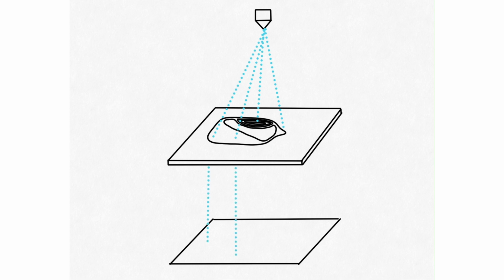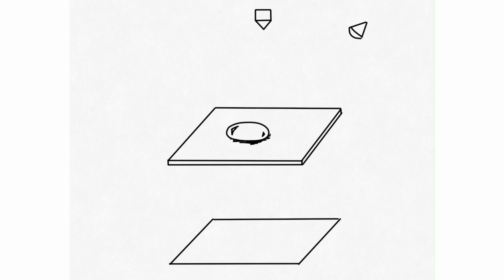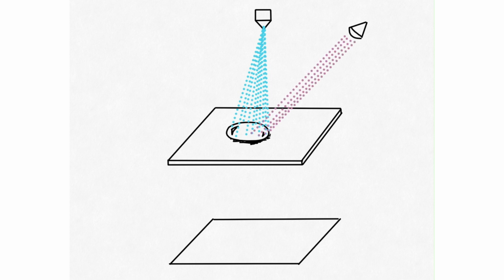This requires the specimen to be thinly sliced to provide us with an internal view. The SEM, on the other hand, gives a three-dimensional view of the specimen, as electrons are reflected off the surface of the specimen. This means that no internal structures will be seen.